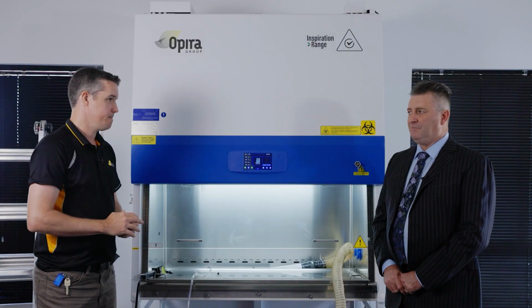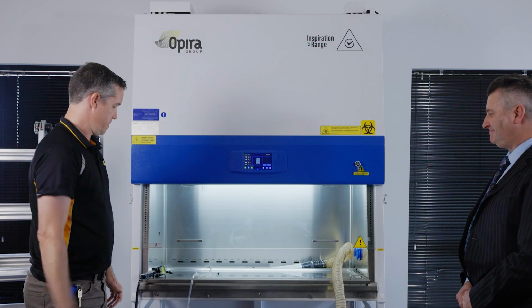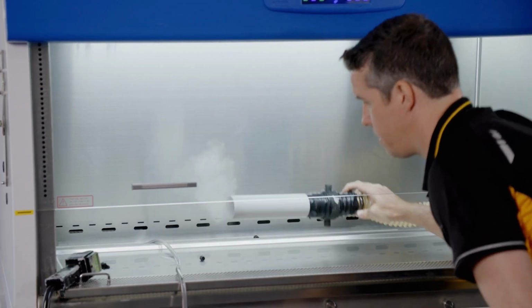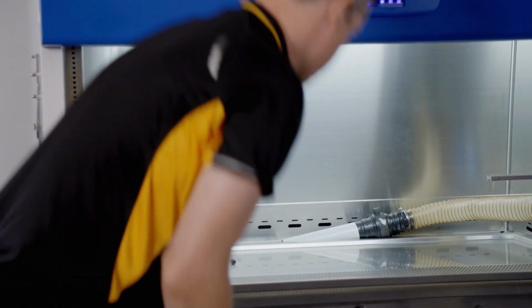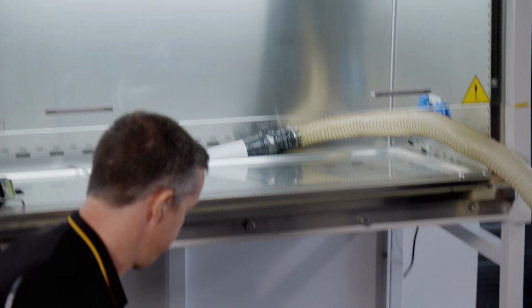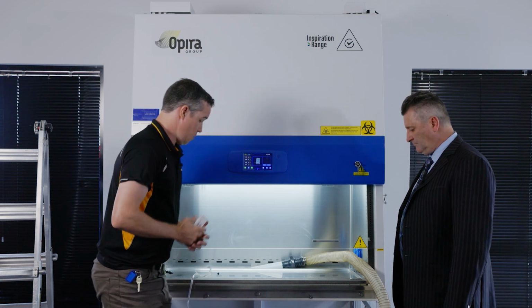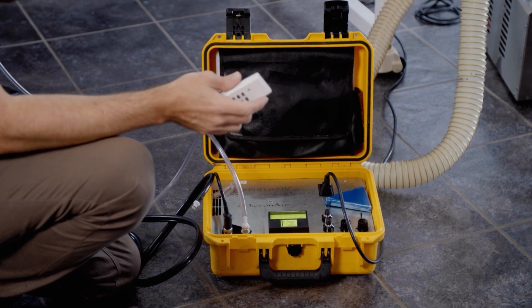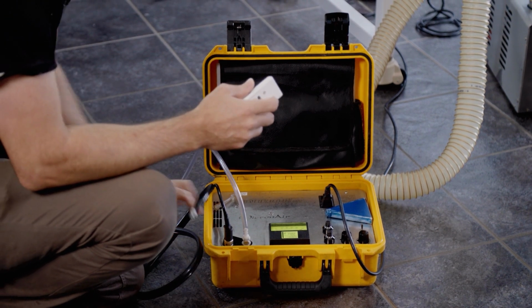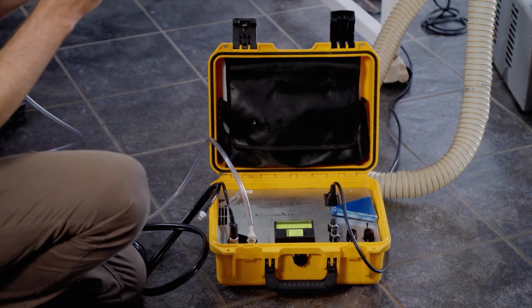So is it time to make some noise? Yes, we'll make some noise and you won't be able to hear us anymore. Aerosol has been released. Photometer is sampling. I've taken my absolute concentration. I've got to record that in the report as well. Once I've done that, I'll calibrate it to the 100% reading. Once the photometer is accurately pointing to 100%, I can change the range setting down to 0.1 and start scanning the HEPA filter.